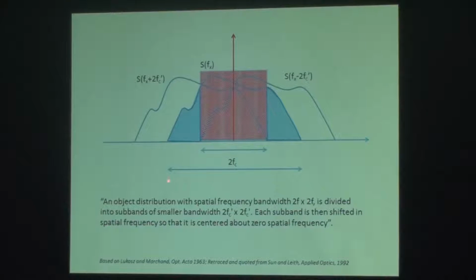So what you do is use multiple phase images. You need to use a specific type of grating and a patterned illumination on the sample. Imagine you use 5 different images instead of one image. You collect the 5 different images, moving these frequencies which are unavailable here in a sequential manner, using 5 different phase gratings.